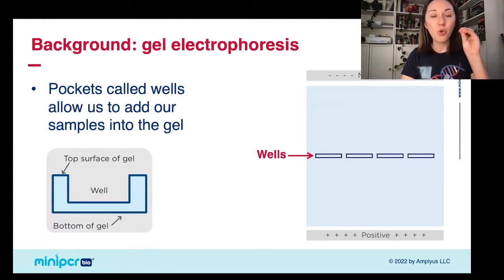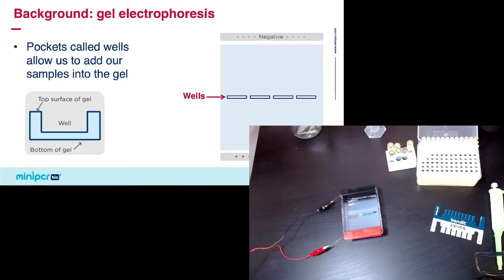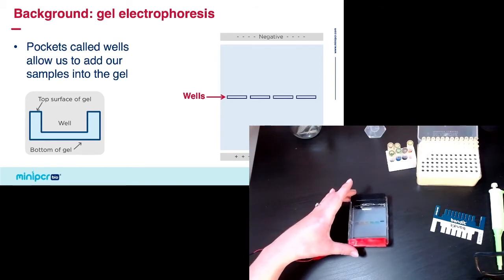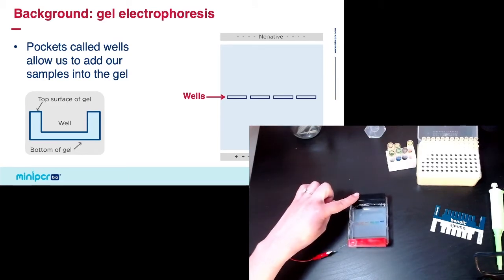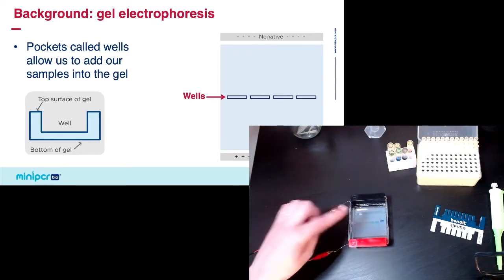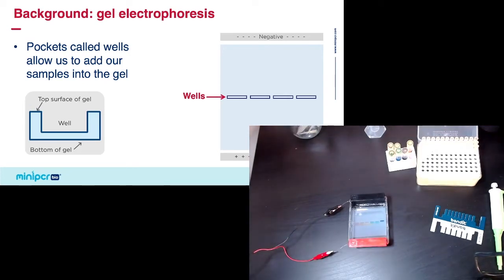So again, we added our dye into little wells in our gel. And I'm going to switch to a split screen here. I want to point this out. So you can see here that we have the different components of our electrophoresis kit. On one side, we have our negative electrode. On the other side, we have our positive electrode. And in the middle are these wells. And these wells really look like pockets. And that's where we add our samples in. So today, the sample that we're adding in are our dyes. But you can also imagine that if we were using a DNA gel electrophoresis setup, the sample we'd be adding in there would be DNA.